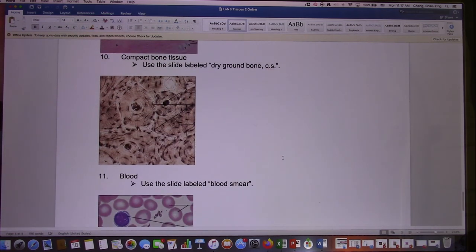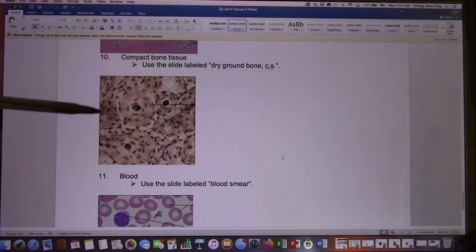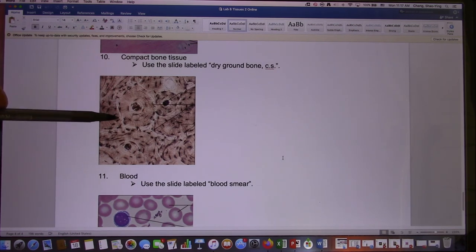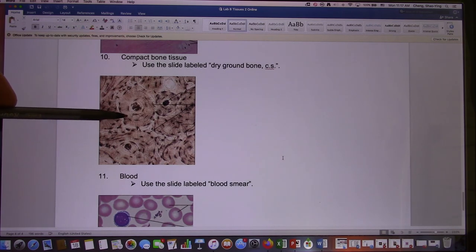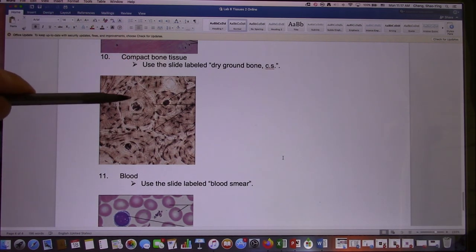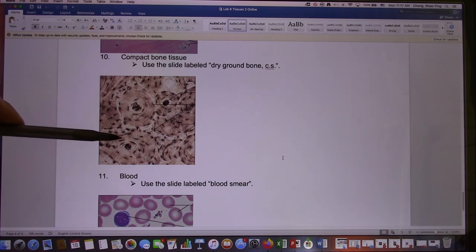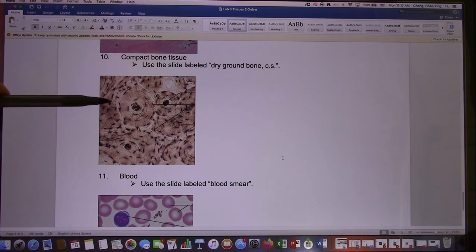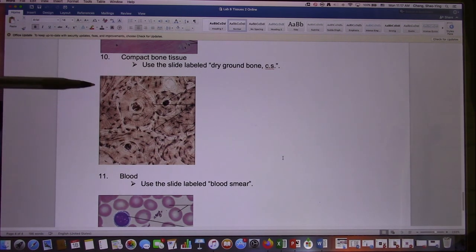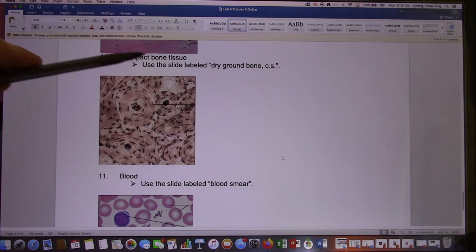The next one is bone. Bone cells stay in osteons. These small cockroach-like structures are actually the bone cells — osteocytes. This is one osteon, this is another osteon, and this is the central canal. In this lab you don't need to identify those structures — you just need to tell me what kind of connective tissue it is. If I give you this slide, the answer would be bone.